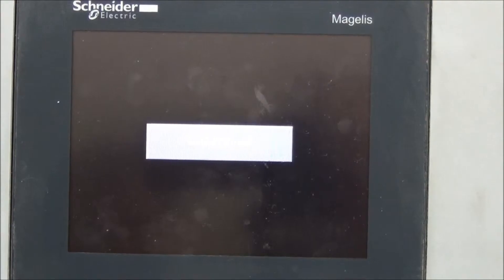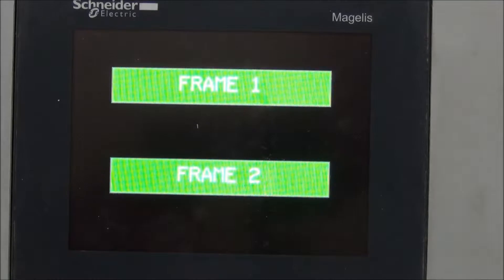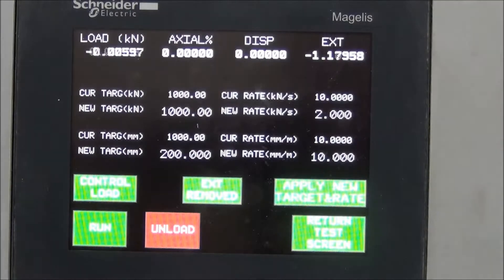Tensile Test Demonstration: To start the test, touch date and time and touch OK to confirm. Choose the correct frame number and touch on the box. Touch Tensile Test. Touch Load and Displacement to reset. To set the tensile speed, touch the target box.